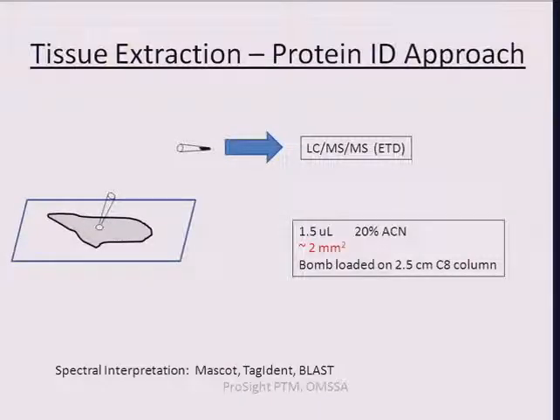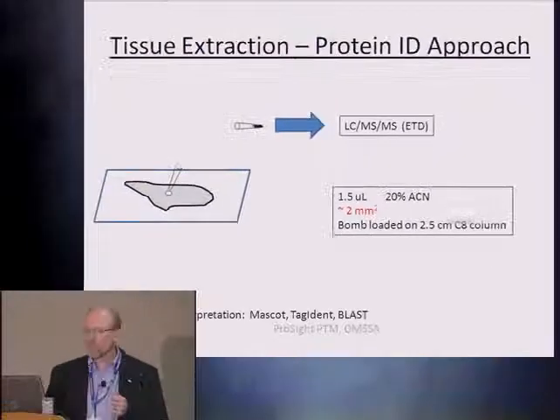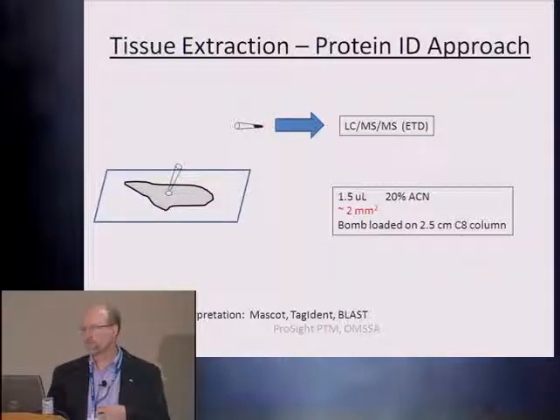So the last part of my talk, I'd like to talk about one of the bottlenecks and where I think at least one future area of investigation will help move the imaging studies forward. So we're getting better and better at imaging specific analytes from the tissue. But the first question that the biologists ask is, okay, you got a signal, what is it? And that takes a lot more time to figure out. And so for lipids, as Tim discussed, we can measure mass with high mass accuracy, and we can do tandem mass spectrometry. But for intact proteins, that's a little bit more difficult.